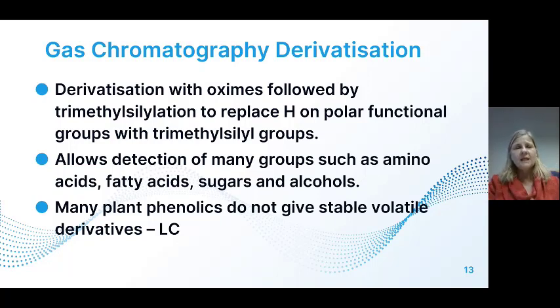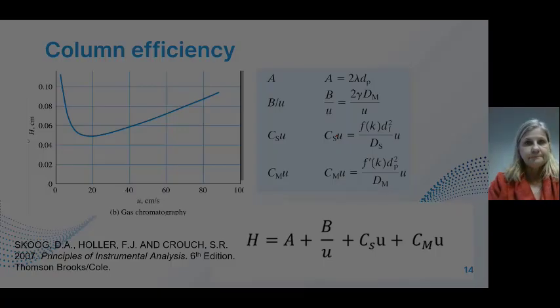However, many plant phenolics will not give stable volatile derivatives. So if we have polar compounds, and especially phenolic compounds, we prefer using liquid chromatography for our separation.